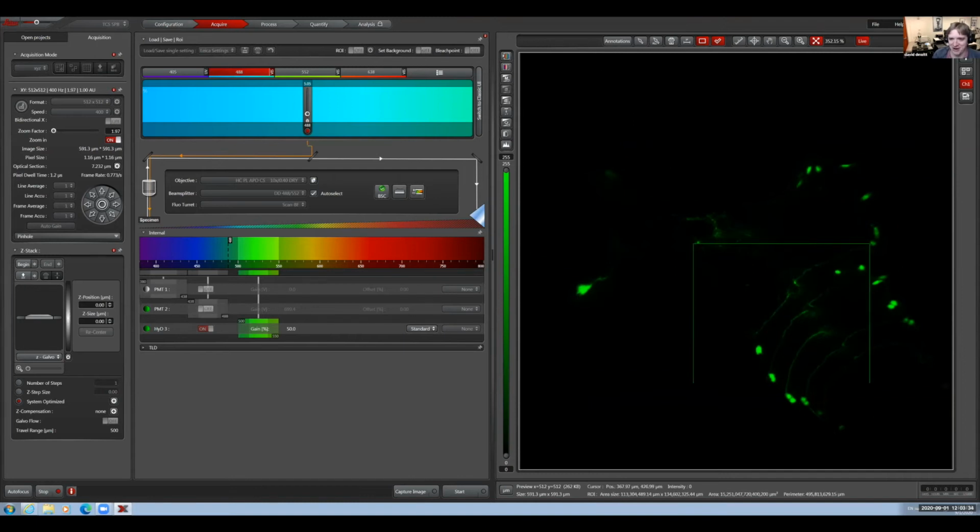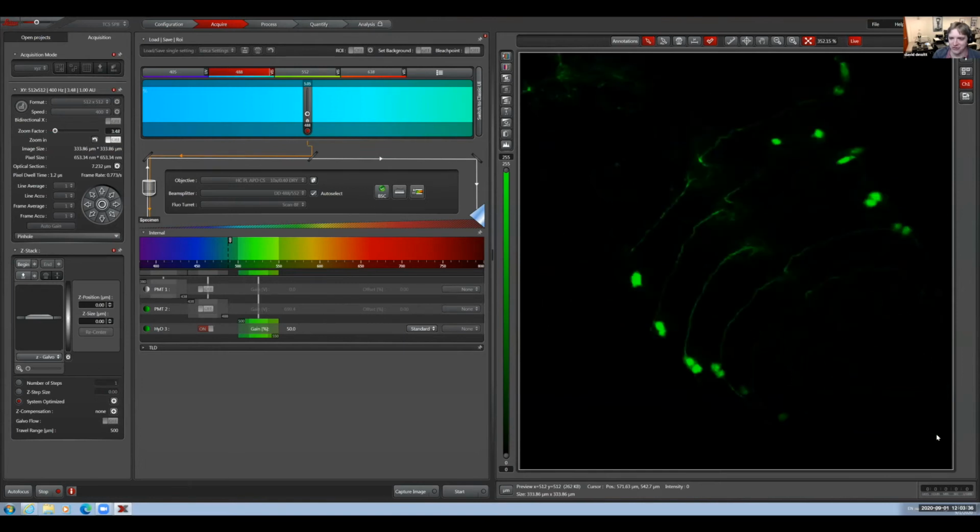So just pick somewhere and wherever you draw a box and let go, it'll actually zoom us in right to that area. Okay, is it going to only take pictures of that? Yes, it's only imaging that area. And it's a true kind of optical zoom where it's putting those 512 pixels in a smaller area. The density of those pixels has gotten higher.